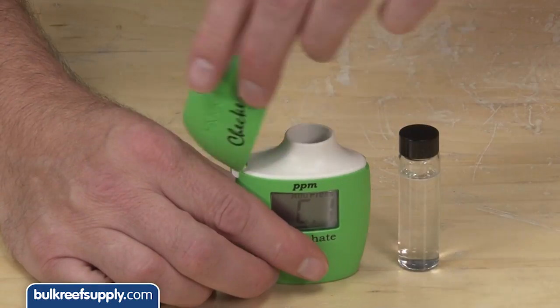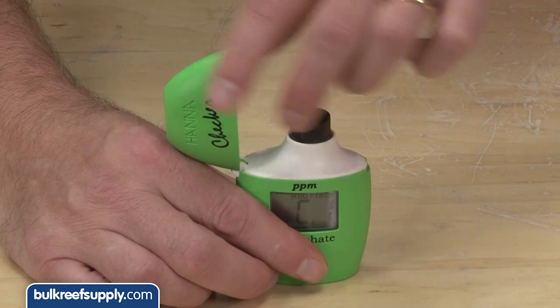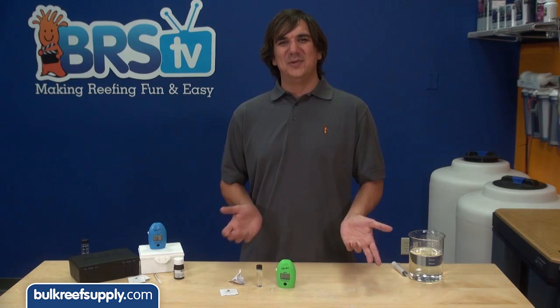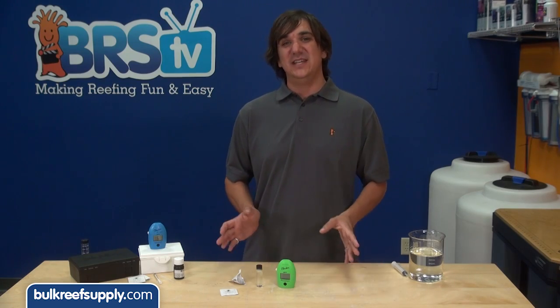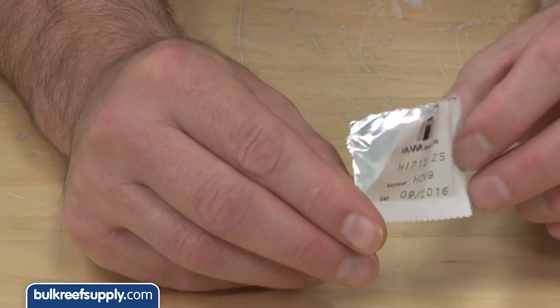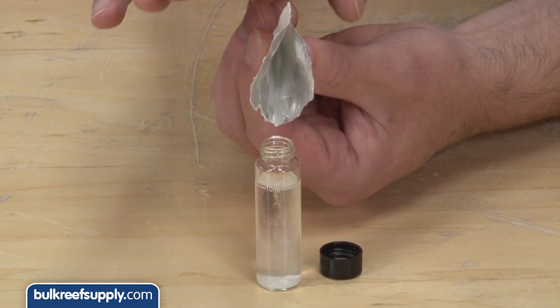Turn the checker on, fill the cuvette with sample water from the tank, place it in the checker, close the lid and hit the button to zero the meter. This time the reagent is a powder, and the easiest way to get all the powder out is to tear the envelope on two sides. This makes it pretty easy to tap all the powder out.